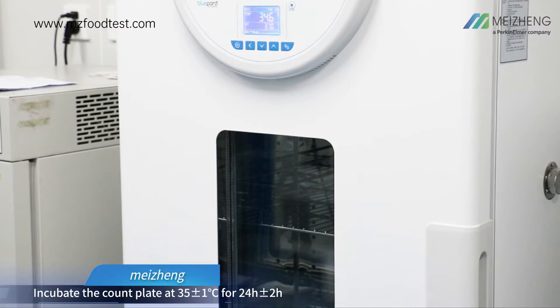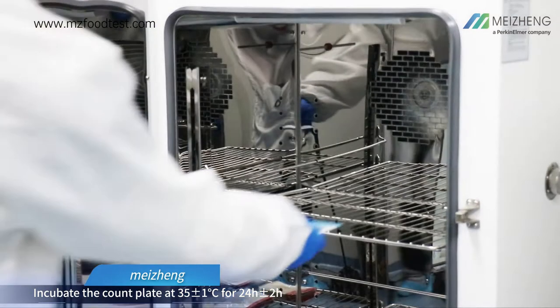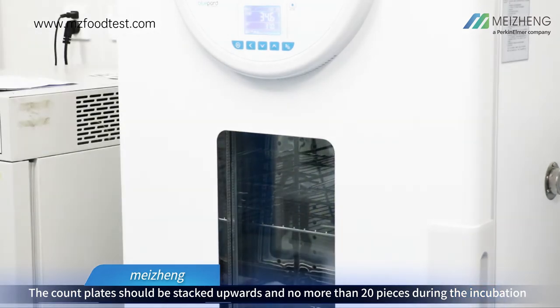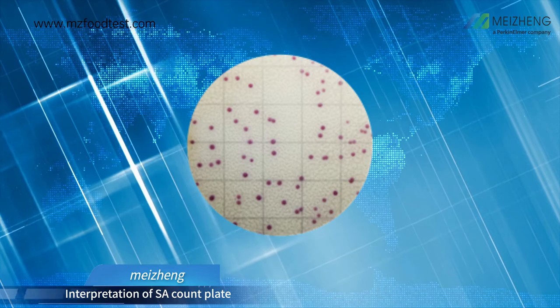Incubate the count plate at 35°C with a tolerance of ±1°C for 24 hours with ±2 hours tolerance. The count plates should be stacked upwards and no more than 20 pieces during incubation.